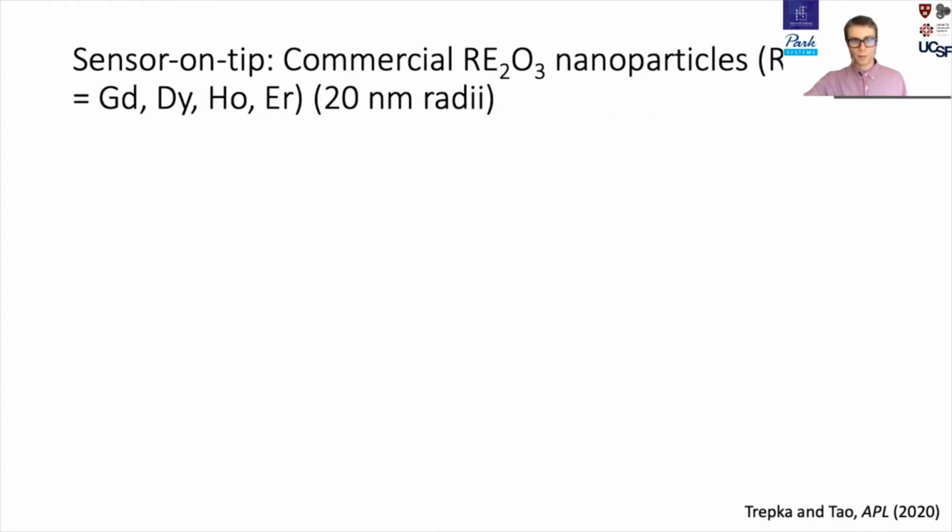The second modality I'm going to discuss today is the sensor on tip modality.